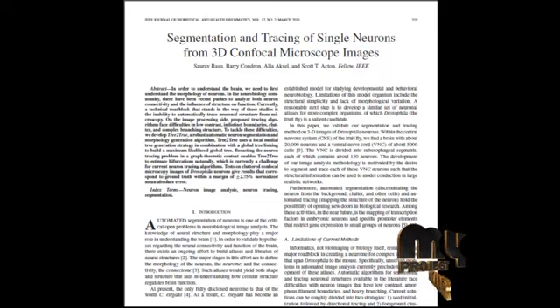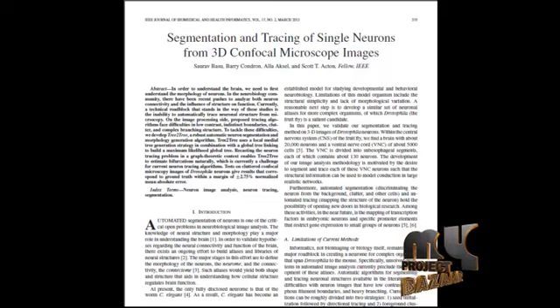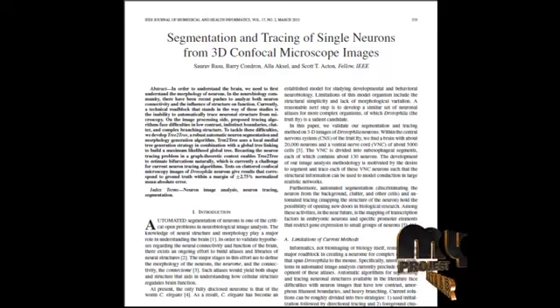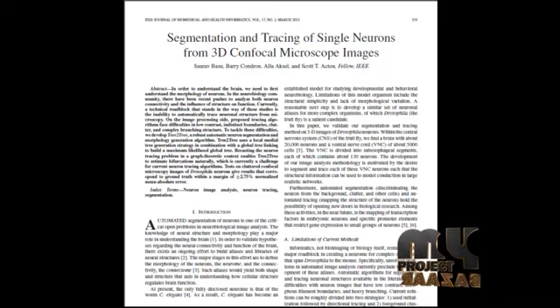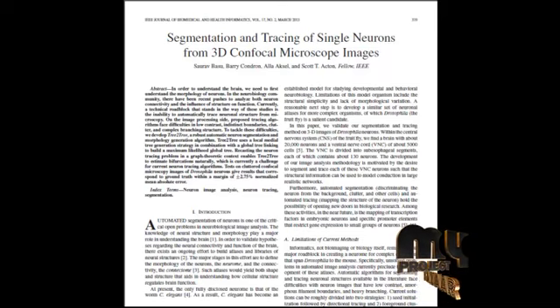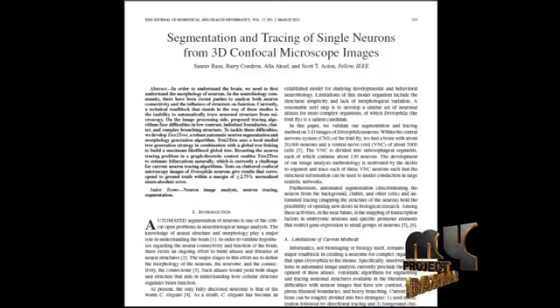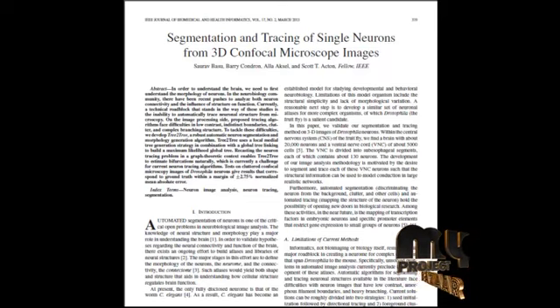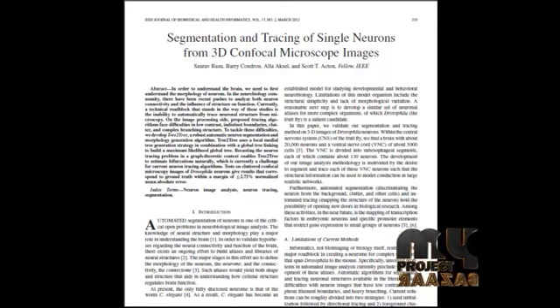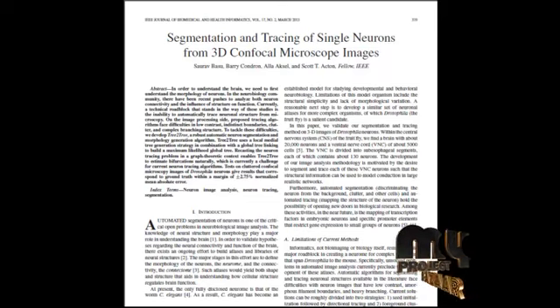After segmentation, we trace the neuron against the original image using the alpha-beta graph pruning algorithm. Finally, we map the segmented neuron back to the original image.